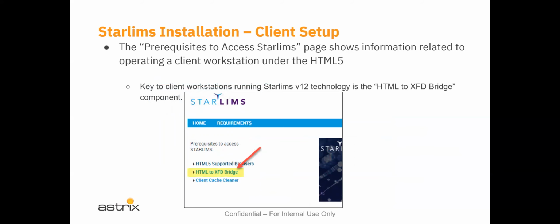So here we are talking about the situation whereby you have instances of STARLIMS servers that are actually 11.7, 11.8, and I think there might be a shadow version out there called 11.9, which were prerequisites to the full HTML5 v12 technology being released.